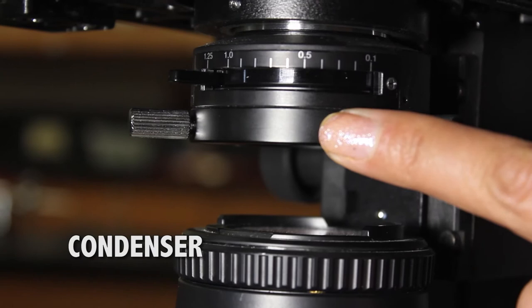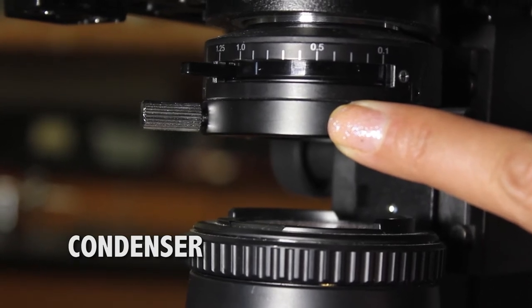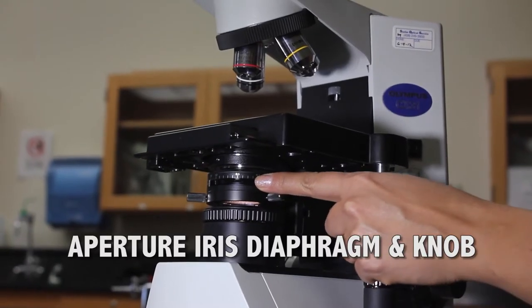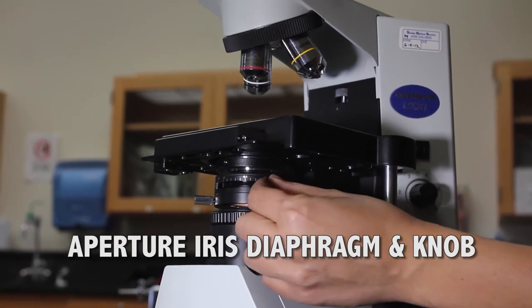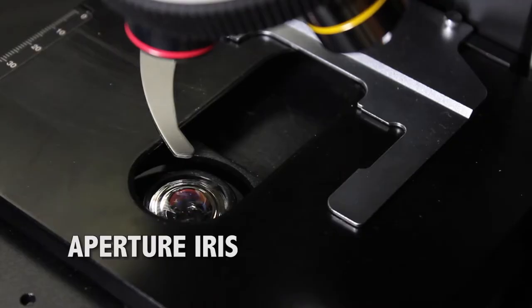Condenser, this focuses the light on the specimen. Aperture iris diaphragm controls the contrast. Diaphragm control knob will open and close the aperture iris.